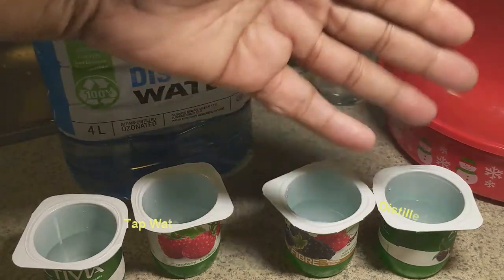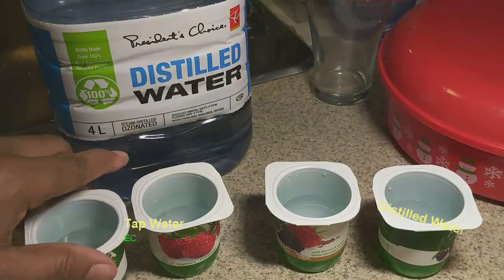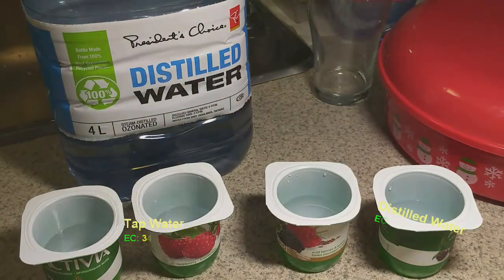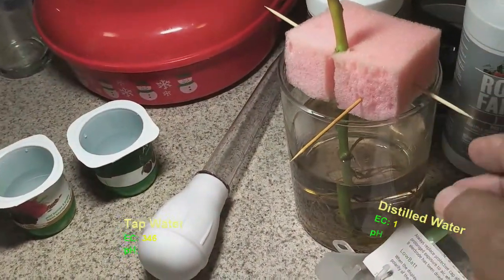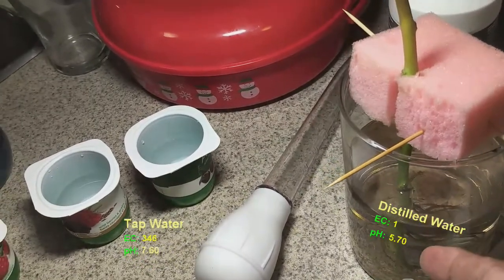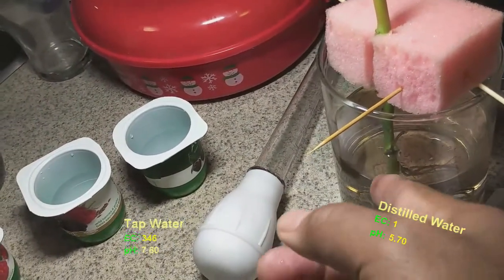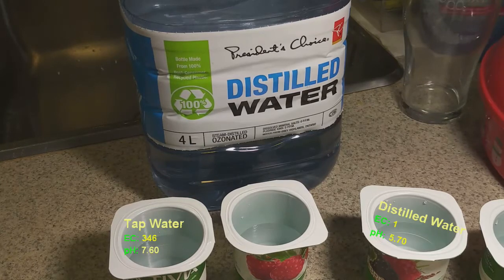Notice I'm using yogurt containers that I scrubbed out as my makeshift beakers to measure these things — sometimes you've got to be a little creative when you don't have anything in your house. It's always best to get a bottle of distilled water and grow your plants in that, adding nutrients to it, because you get a more accurate reading and you don't overdose or over-toxify your plant.